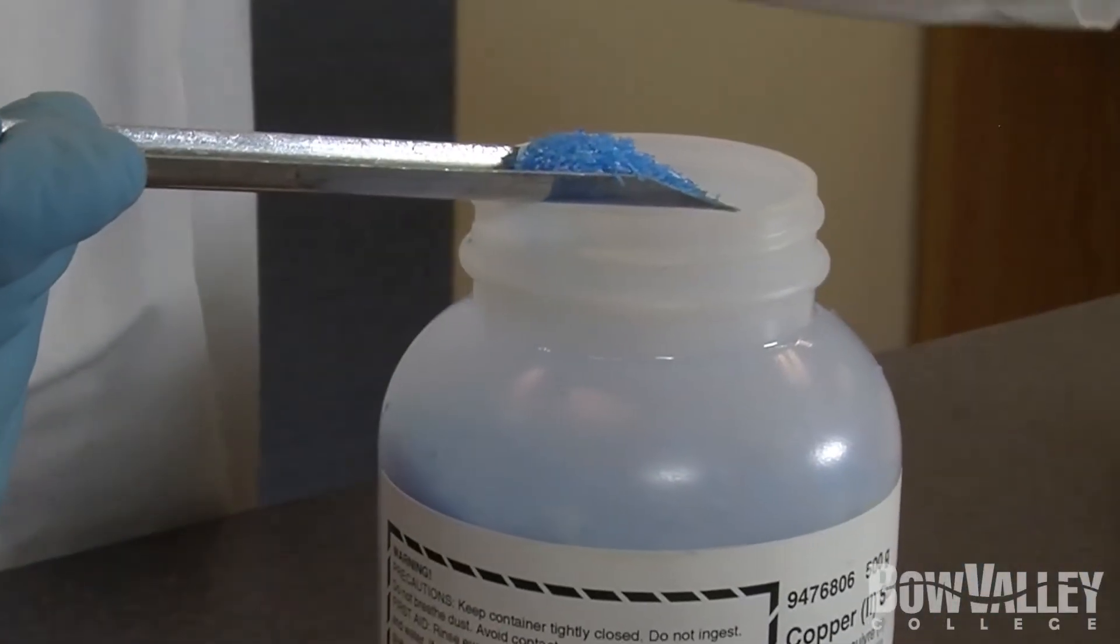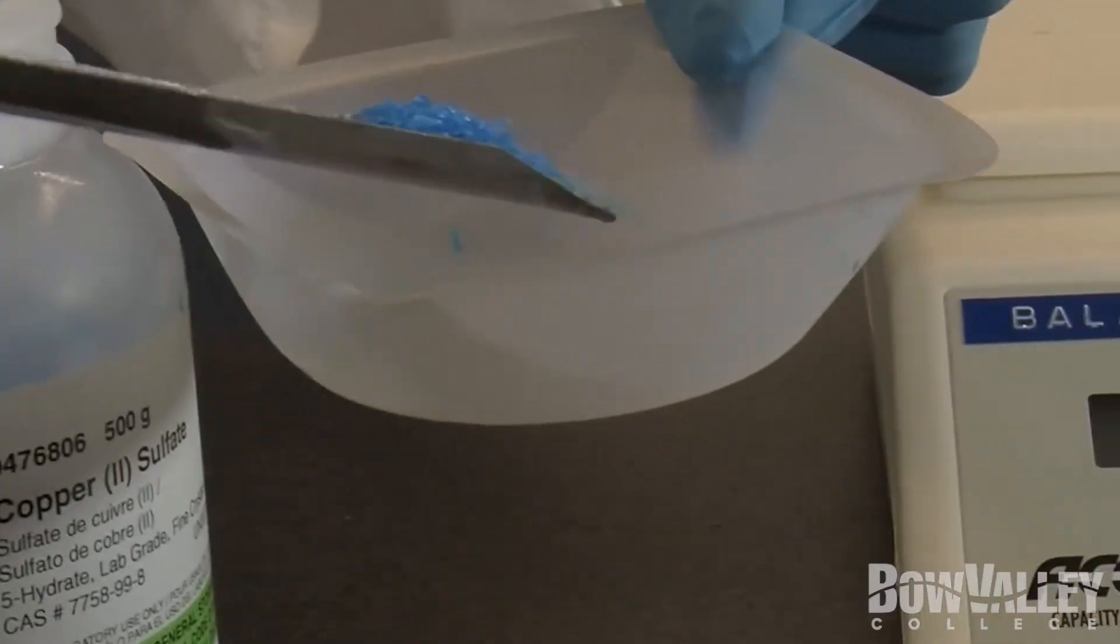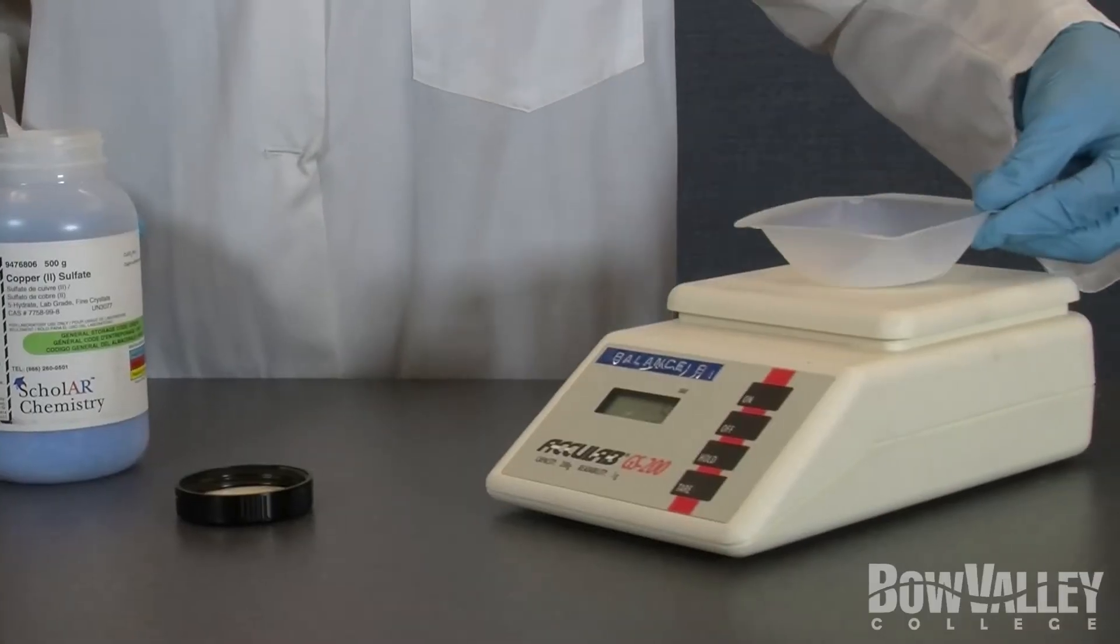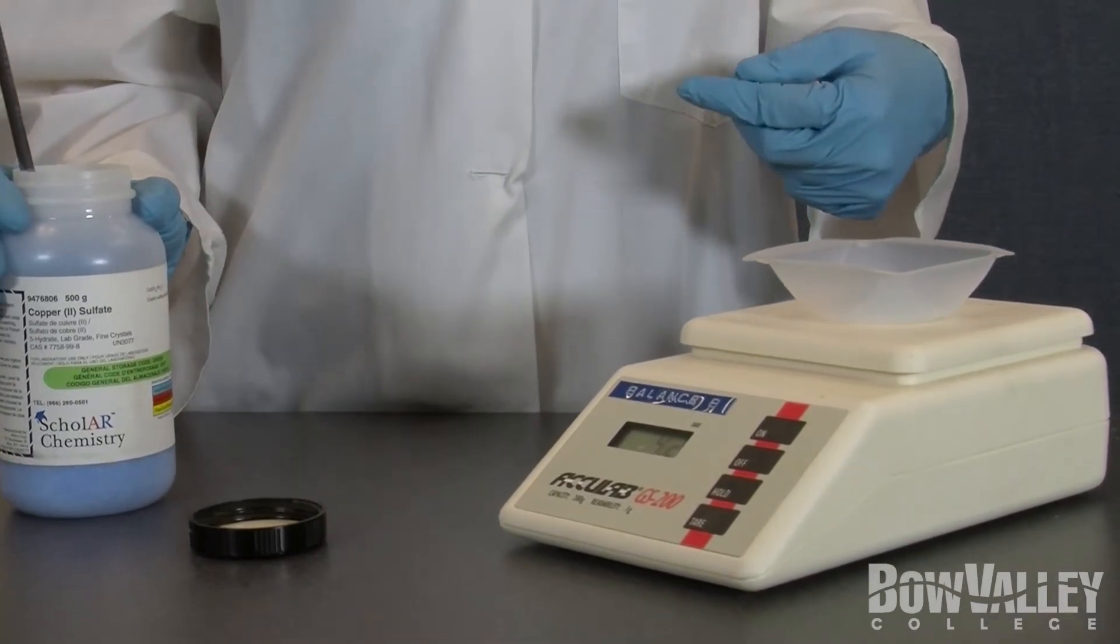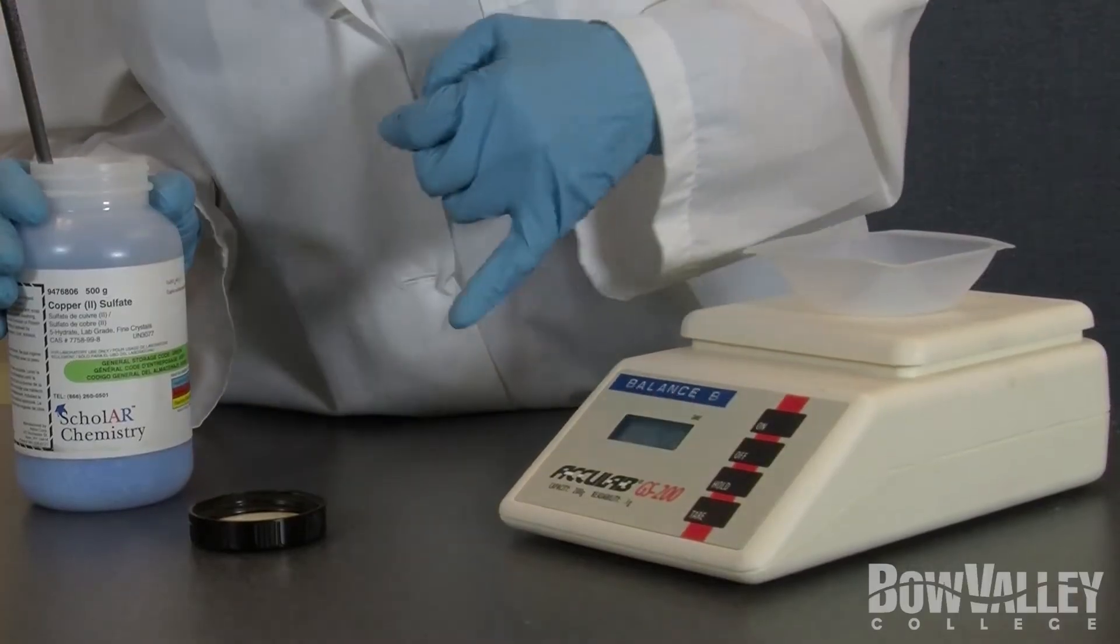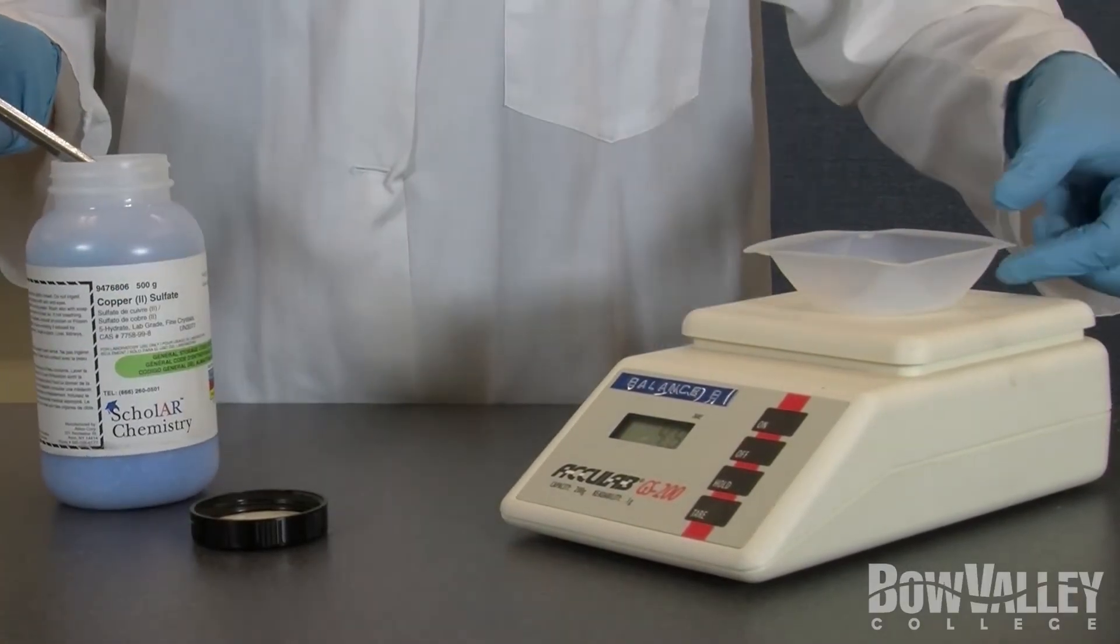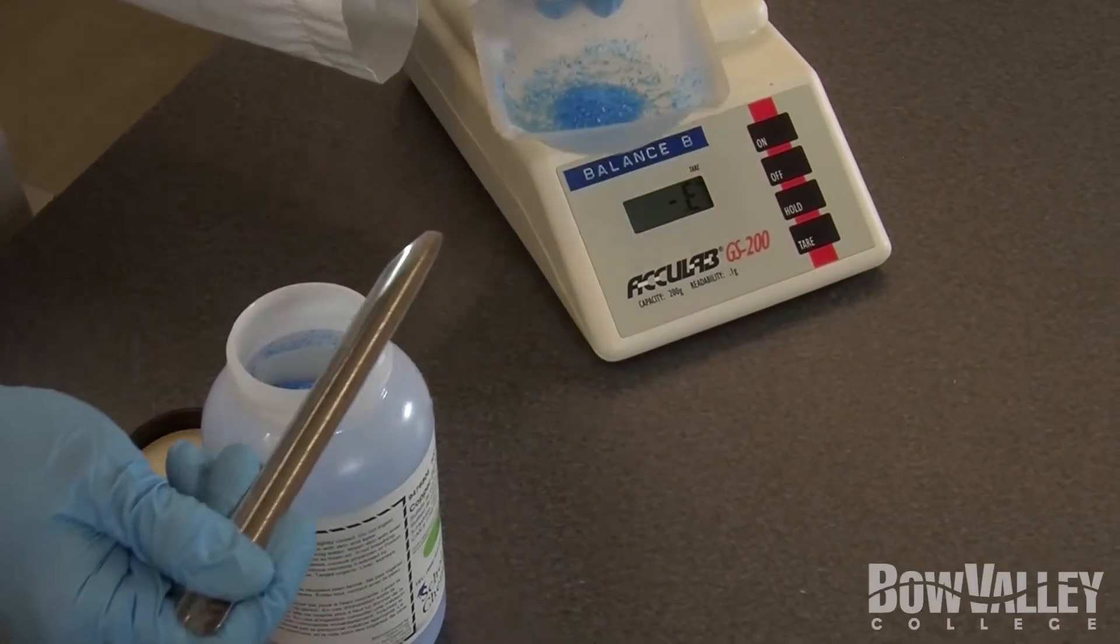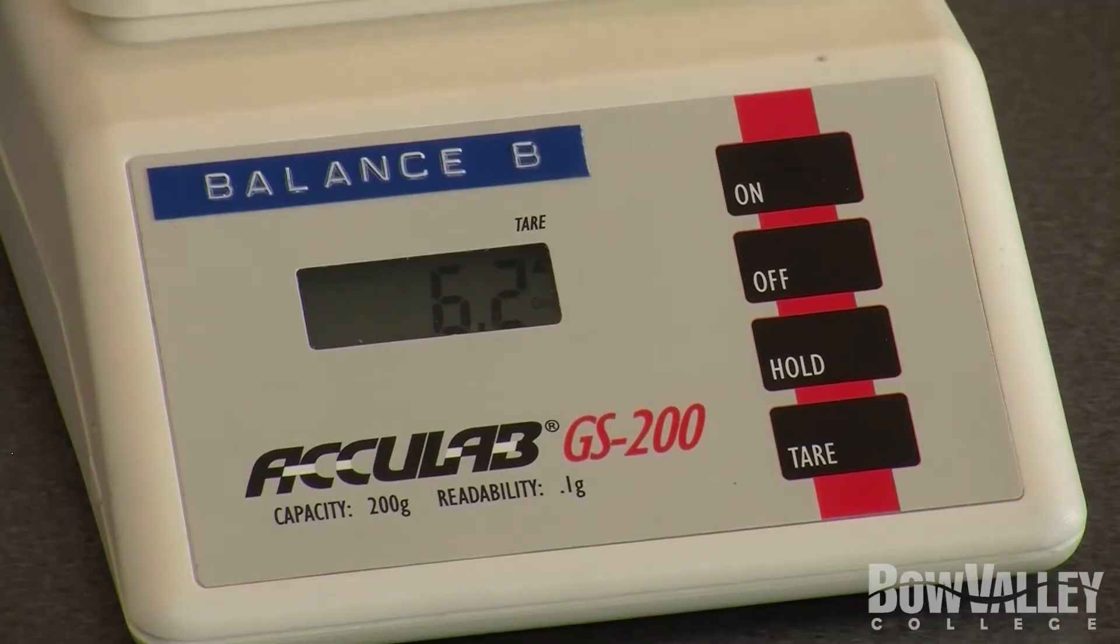Take the weighing boat off, put your product inside and place it back on the scale. The reason we do this step is to avoid any contamination of the scale or the product. We have a reading of 4.2, we need to still add more product. We have reached our value needed, 6.2. We are now ready to make the solution.